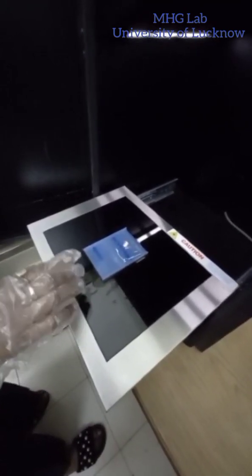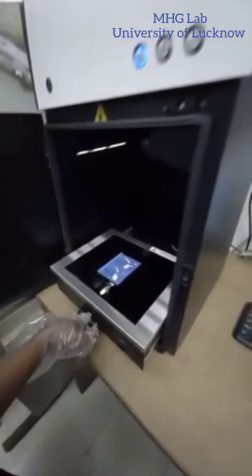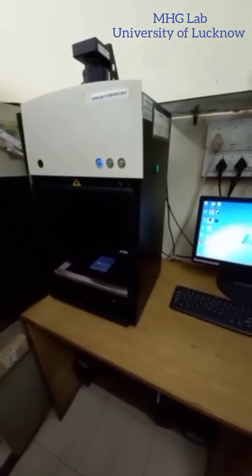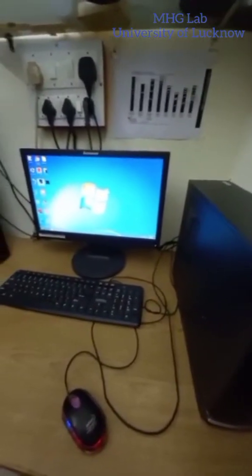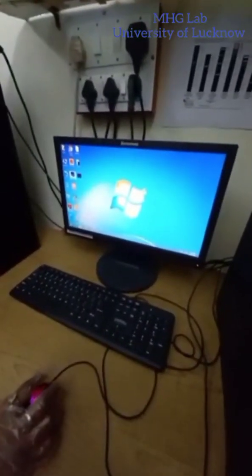We have to keep in mind that there should be no bubble trapped below the agarose. You can see there is no bubble, so we will now push this inside and we will close the door.